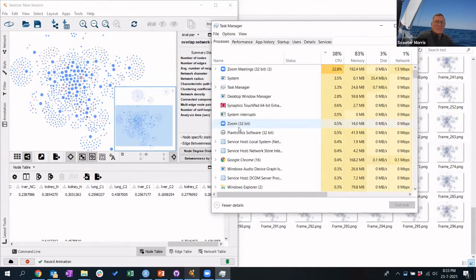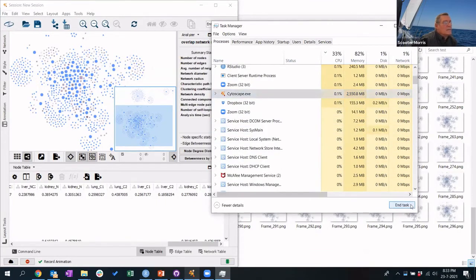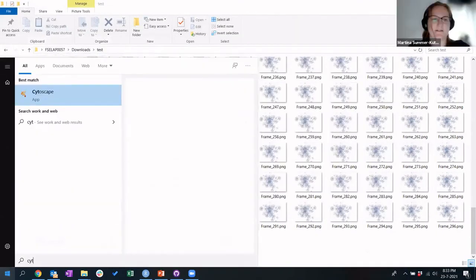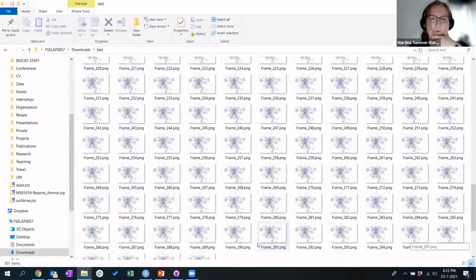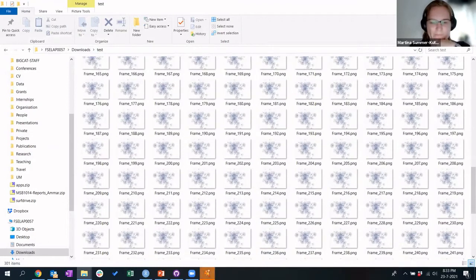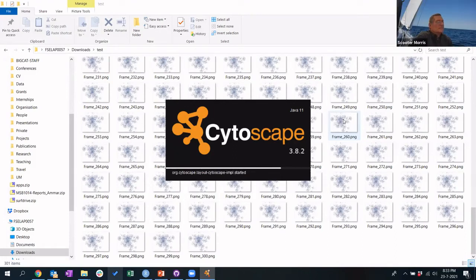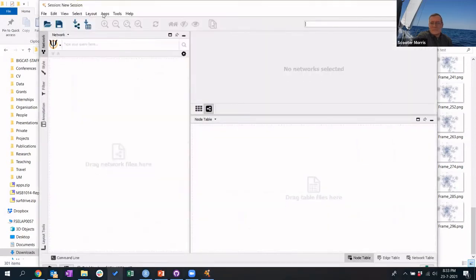Let's see. I can also show my version if you want. I'll just start it now. So unfortunately, we won't have the video now, but I think you would now have an imagination of how it would look. It would paste all these frames together, and it would interpolate from one frame to the next, so from one snapshot, or capture, keyframe, to the next capture. And this all works with the SciAnimator app really nicely.